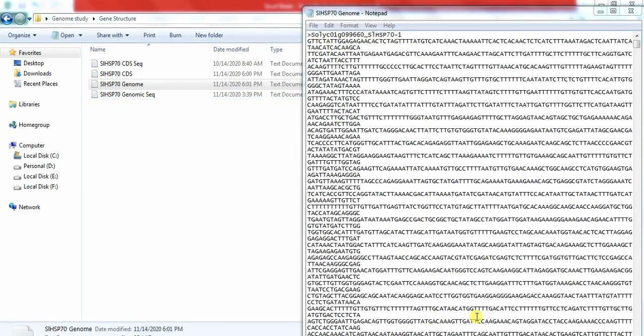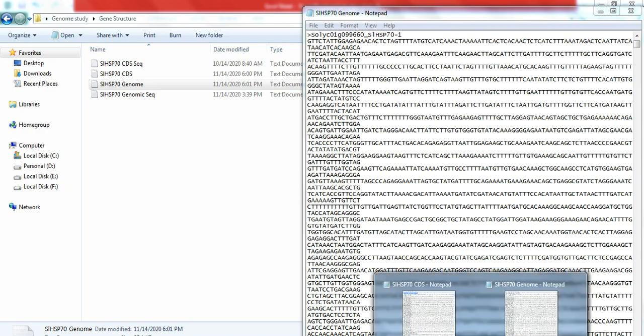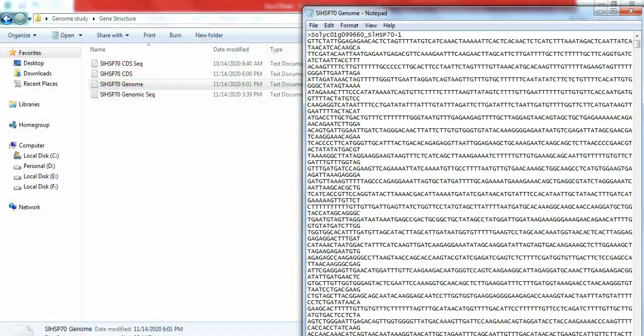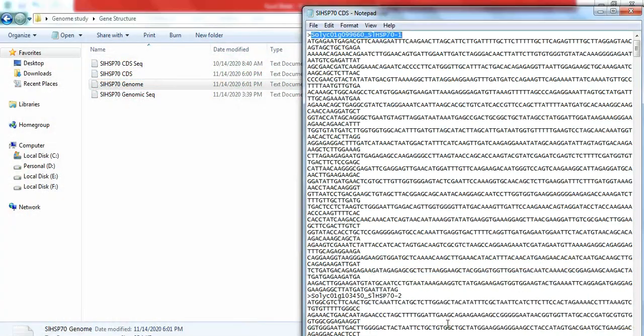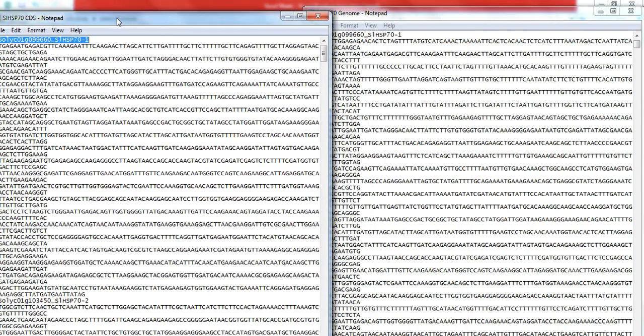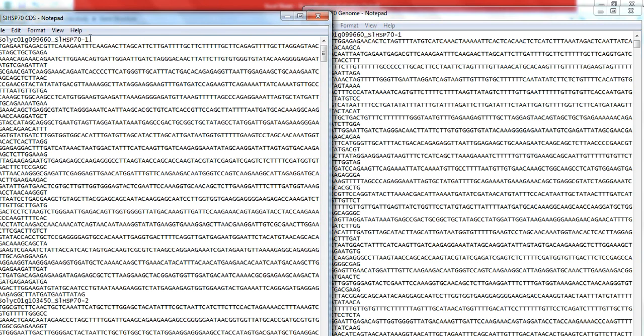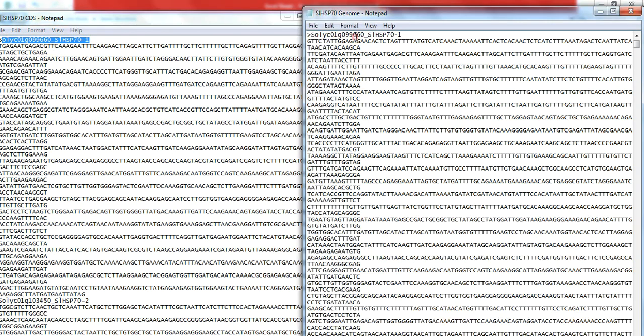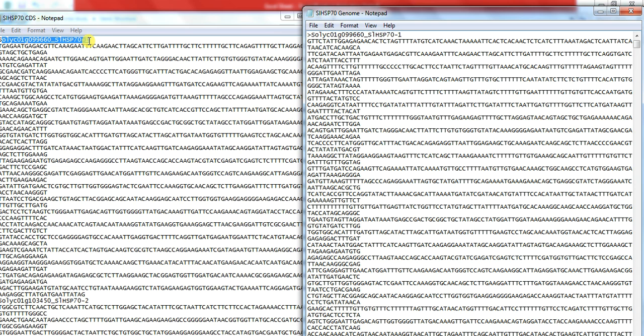Also remember one thing: the sequence and name of the gene in these two files, the CDS file and the genome file, must be same. Like here, if the gene is present in one position, so in genome sequence file the same gene is present at that position. If it is in position one, this one is also on position one, and their names are also same. There is no difference in the gene name.